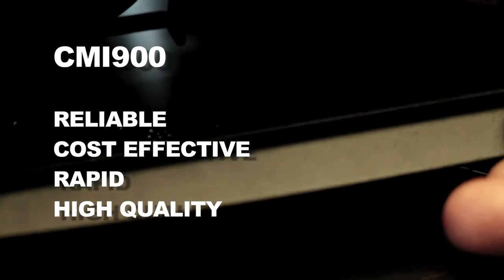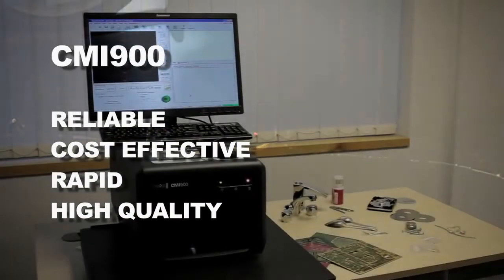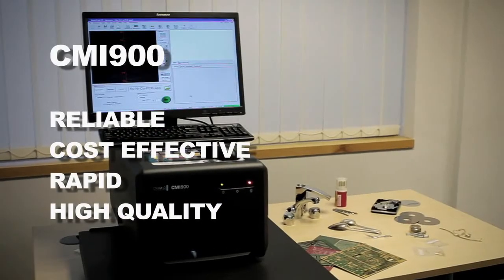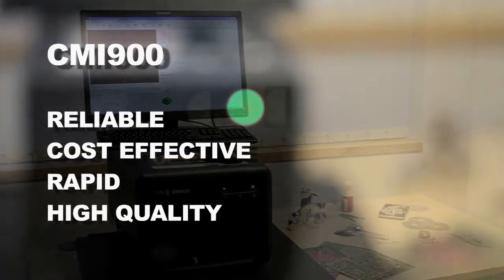The CMI-900 provides rapid, accurate results for coating thickness measurements and composition analysis, day after day, with no sample preparation.